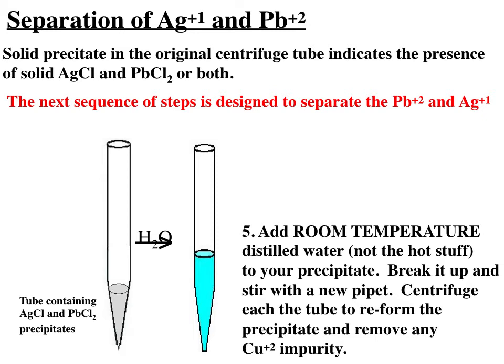Now the first set of steps is actually done in order to remove any contamination due to maybe the presence of copper. Remember what I said: when you use your pipette and draw the liquid off the top, which contained the copper, it's virtually impossible to get all of that solution off of the precipitate. So there's some contaminant of copper present.